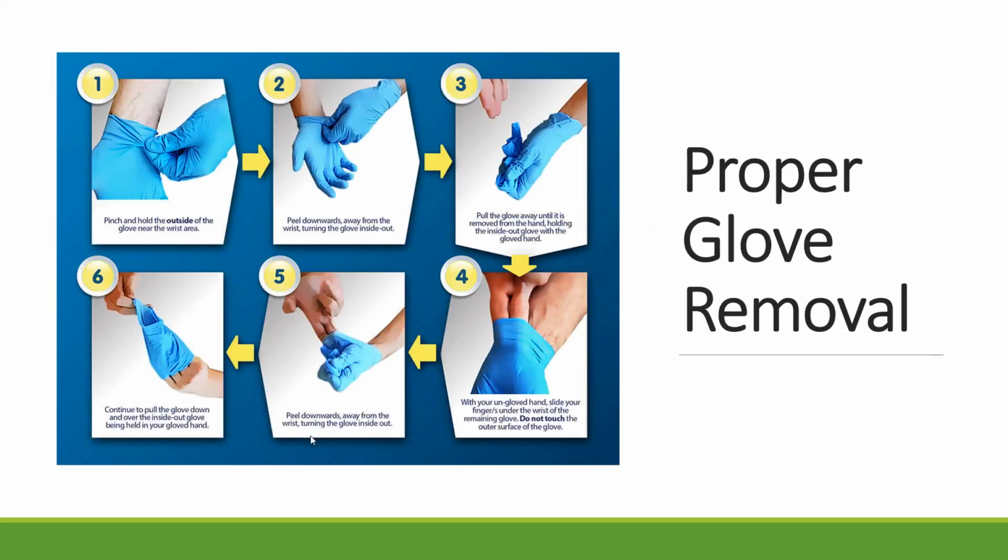If we were in that wet lab or the physical lab, one of the things that I go through with students is how do you properly remove gloves? Because when you are in a lab setting, you are wearing gloves, just like if you were in clinicals or other areas. So how do you remove gloves properly so that you're not contaminating yourself? Because if you've been working with your gloves on, think about it. The outside of those gloves will have microbes because they came in contact with that.